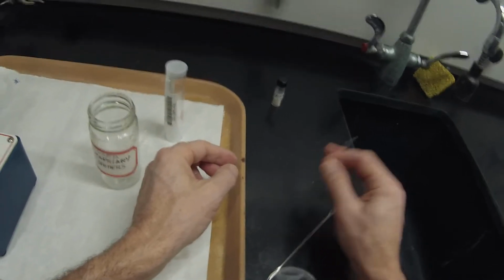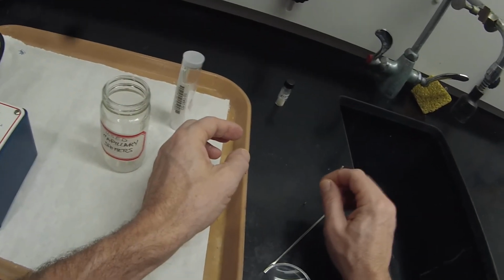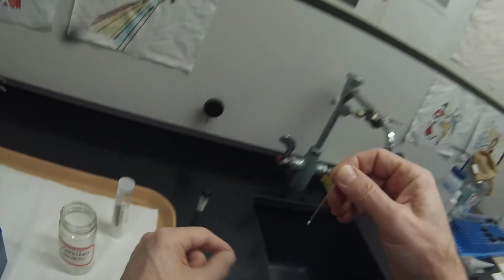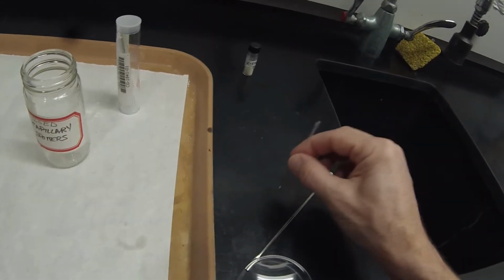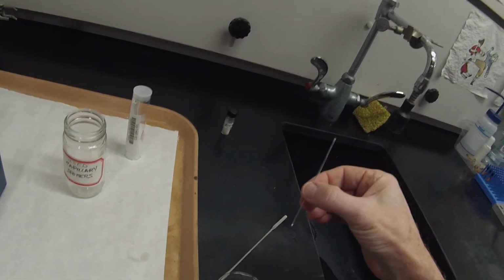You can also throw it down one of those glass rods. But in this case, I think just tapping it on the bench top is going to work pretty well. So you get a nice uniform bit, about 3 millimeters or so. It should work well for a melting point.